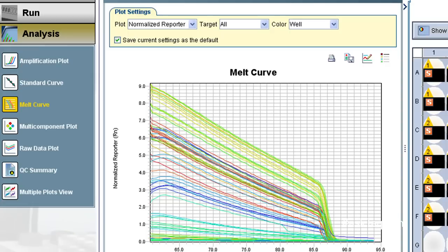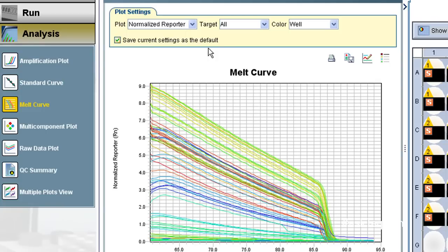Because of this concern, users run melt curves after each experiment. They do this by slowly raising the block temperature from about 60 up to 95 degrees Celsius and monitoring fluorescence. As you can see, signal drops slowly until at some point it drops off suddenly to zero. Halfway down this drop-off is the presumed melting temperature of the product created during PCR.